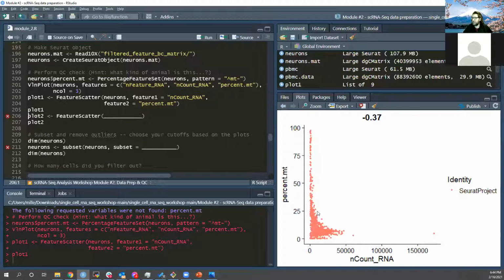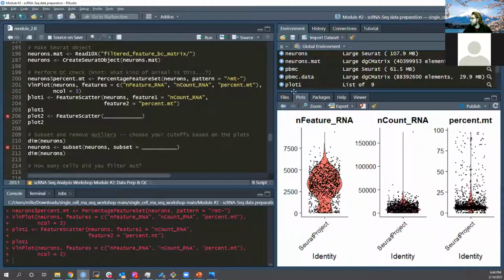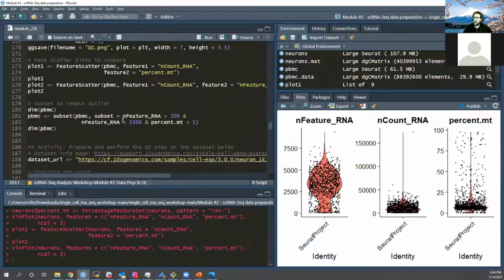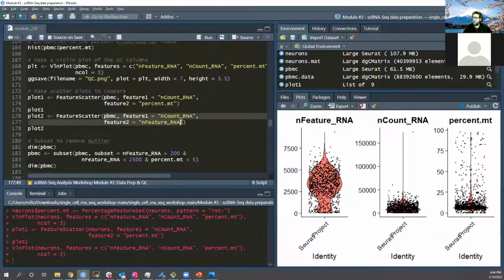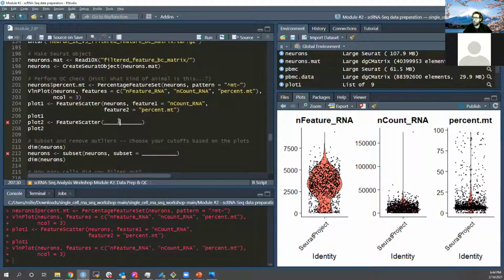The best that I think we can do to rationalize how we handle this is we can look at the violin plot. We can say, all right, the vast majority of these are sitting here around 10%. So the upper limit of this bulk group is around 15 or 16%. I'm going to set this at 15%. And this is where things become kind of subjective. It's one of the drawbacks of this way of approaching your data, that at some level, this is partially subjective.